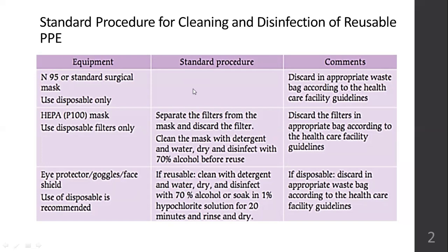For example, the N95 mask. It's not reusable. It's disposable. Once you use it, you have to throw it away. N95 mask should not be reused. You have to discard it in the appropriate waste container, waste bag. They will have written information nearby on where to discard it. So it has to be discarded in that particular bin. You don't have to follow any standard procedure here.